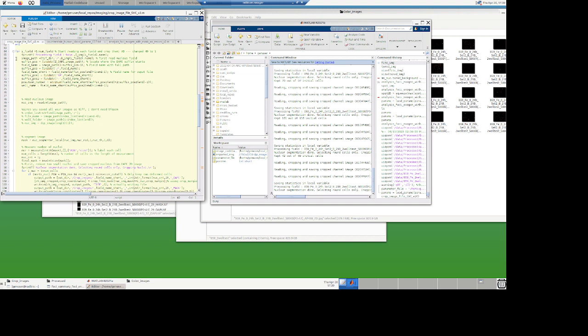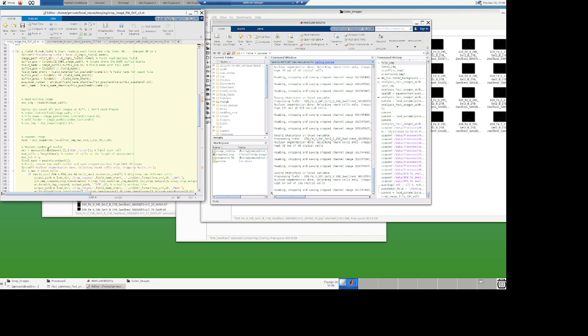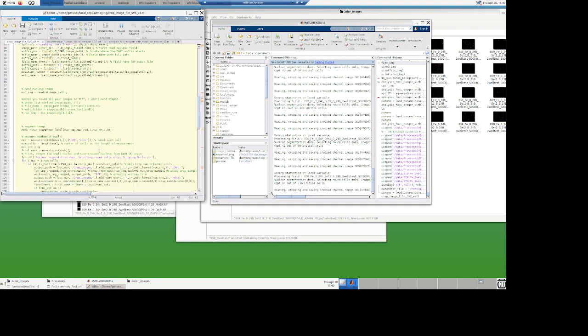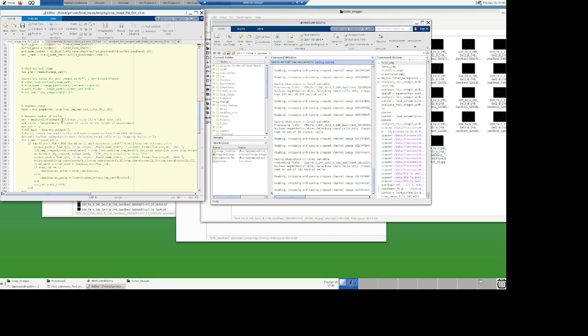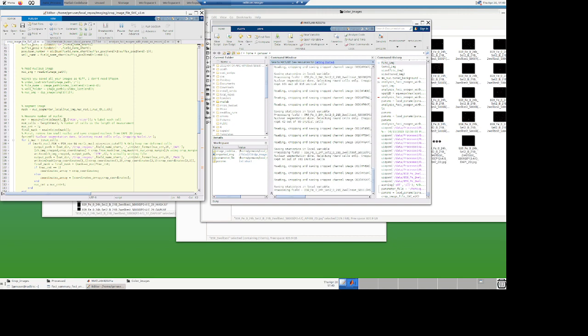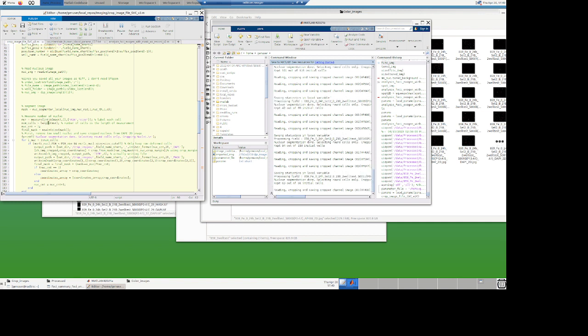So let me go back. I read the field, I do the segmentation here, and then the parameters for segmentation are right there. Then I use a function that is awesome in DIPimage called measure. So the way the function works is you pass first, well, in this case, I'm only doing one measurement. I'm passing the mask. So it's a Boolean. And I'm asking measure P2A and the size on this mask. And so it will create MSR, and I have a bunch of measurements.